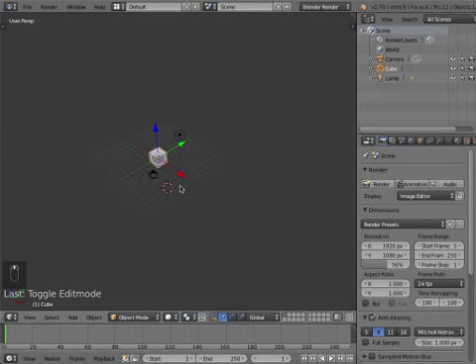So just to give you a basic outline of the fields that we have in Blender, the first one is the 3D view here. That's where you're going to see all your scene data, so that's where you're going to see all your objects. The second one is the outliner here. That's where the object information is. So you can click on stuff here as well. You can see the lamp, the cube, the camera. You can access them here, and any data associated with it will also be accessible here. Don't worry what the scene and the render layers and the world and everything means. We're not going to be working with that.